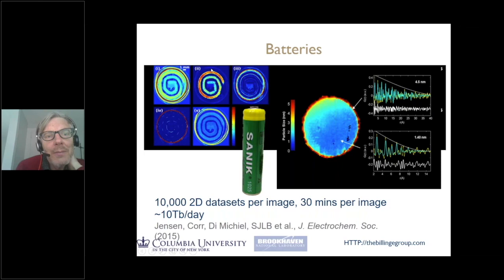But there's also polymer inside the cathode, because the glue that holds the powder particles of the cathode together is basically a polymer. So we can separately study the polymer and the cathode, even though they reside in the same volume of space. So this is very exciting. You can do many, many different things with this.